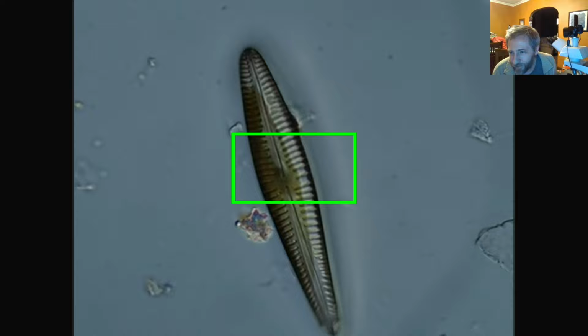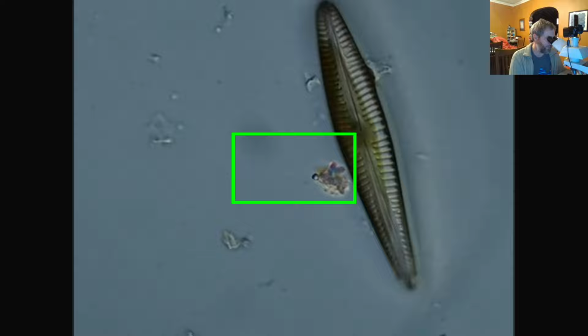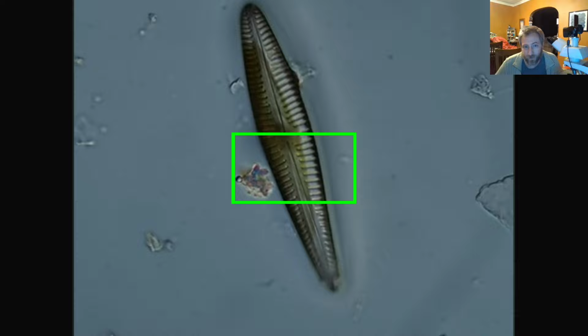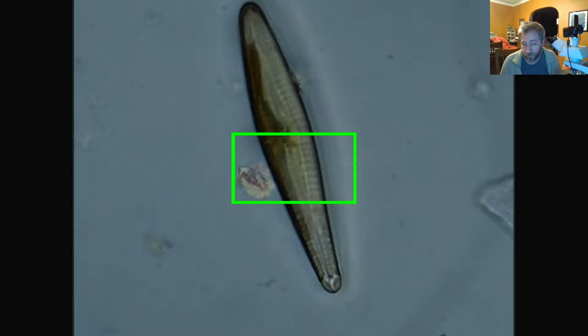Rune Lore, any idea if we see more or less diversity of diatoms near the equator? Most organism diversity is highest near the equator, and diatom diversity is highest in shallow water near the coasts of major places or anywhere there's a lot of nutrients. Usually in terrestrial settings, the diversity is quite high as well. Generally speaking, there probably is a higher diversity in the tropics, but right now we don't know for sure because we've mostly studied diatoms in North America and Europe, and that's where most of our diatomists are and where a lot of them do their work. Part of the issue is that we really don't have a great sense of what the diversity is in the tropics, because a lot of the places in the tropics are still understudied. So, I don't know if that helps.